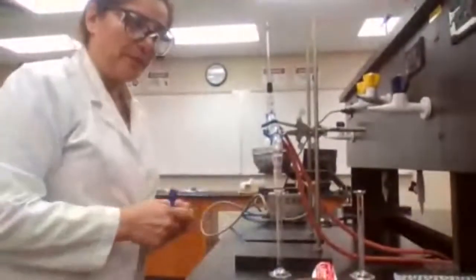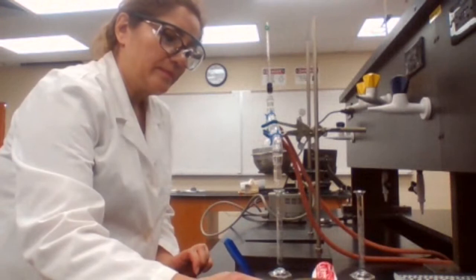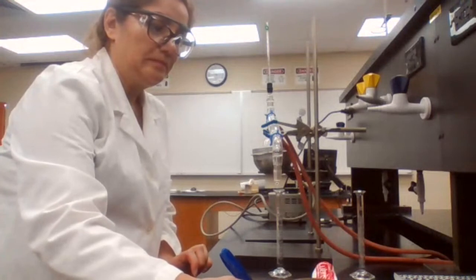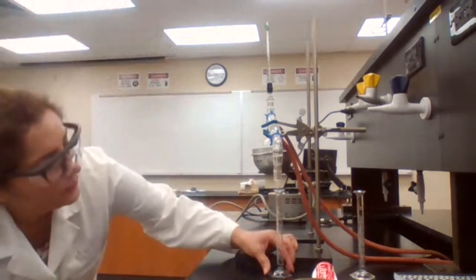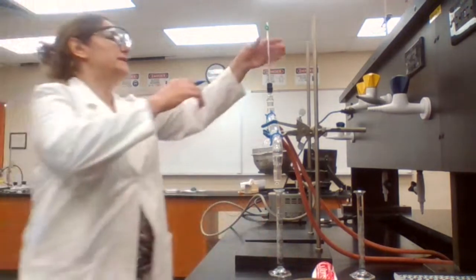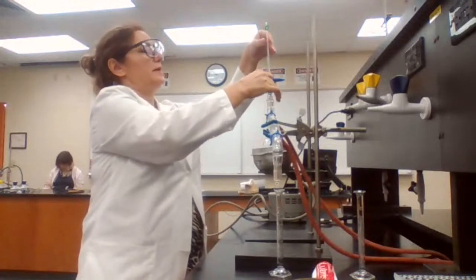Okay, record the temperature, 50 degrees, for the first drop. And then I wait for 1 milliliter. As soon as I collect 1 milliliter of the sample, we need to record the temperature again.